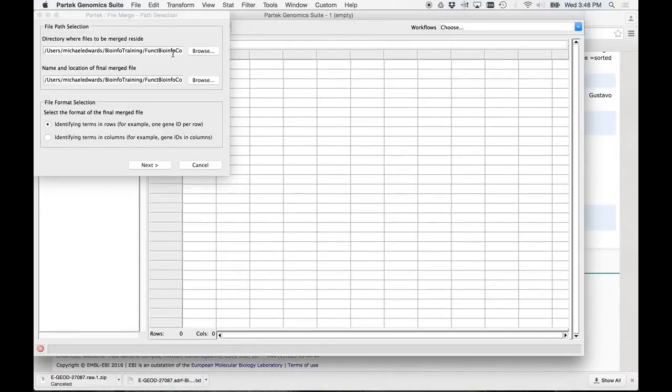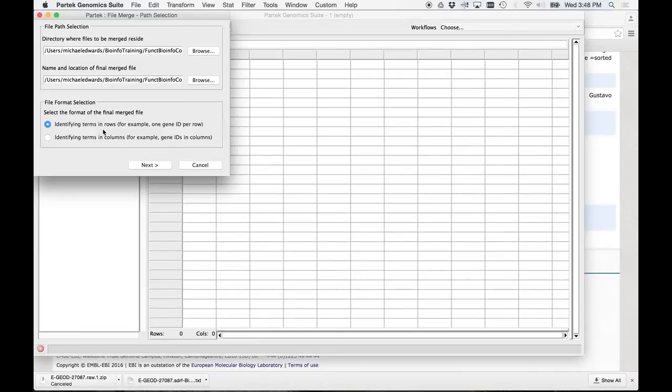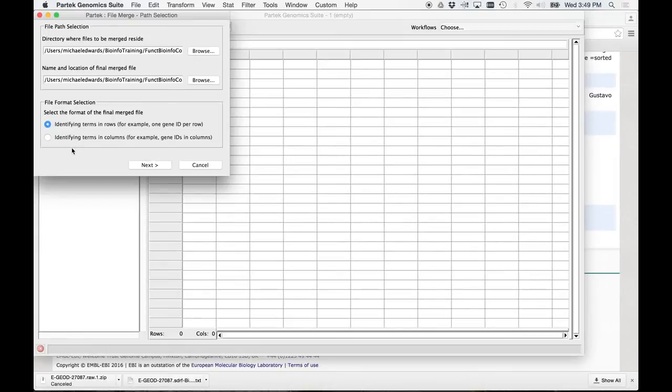You can put it in the same directory. So this next window is just basically telling you where do you want to put the merged file. Now here's what you're going to want to do. When it says select the format of the final merged file, this is telling you where you want your identifying terms. Do you want them in rows? So, for example, in this case, every gene would be on a row and all your samples would be in columns. Okay? I'm going to tell you right now, PARTEC works better when you have your variables in the rows, your samples in the rows, and all your genes in the columns. So what we're going to do is we're going to put identifying terms in columns. Okay? Hit next.